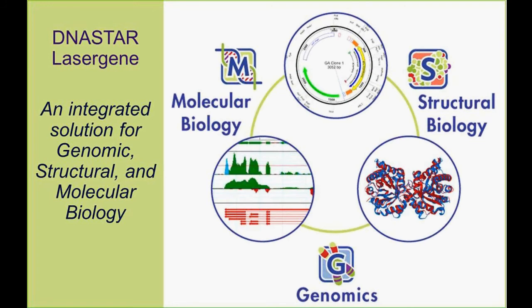We take great pride in creating easy-to-use solutions for today's life science researchers. We feel that we've created a comprehensive set of tools that can handle any workflow in virtually any platform. This focus is quite evident in how our software is organized, both scientifically and logically.